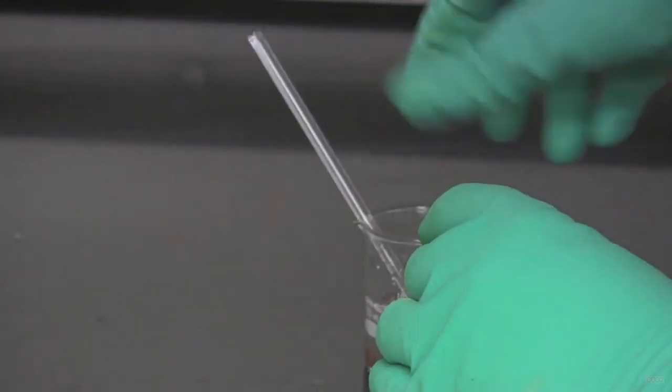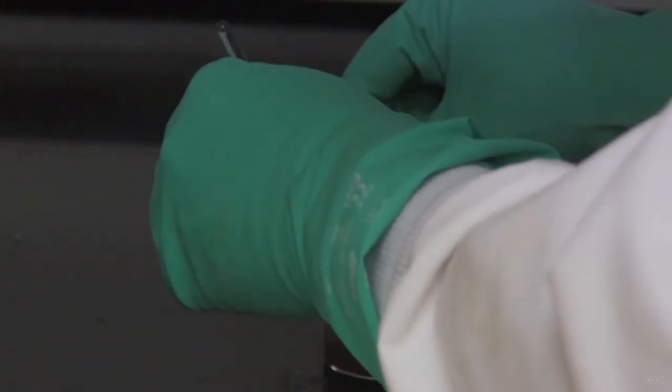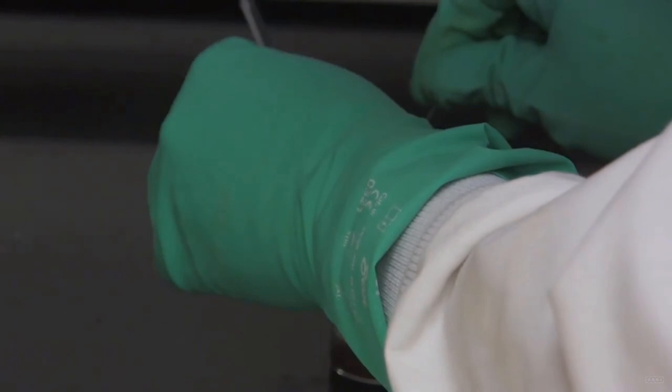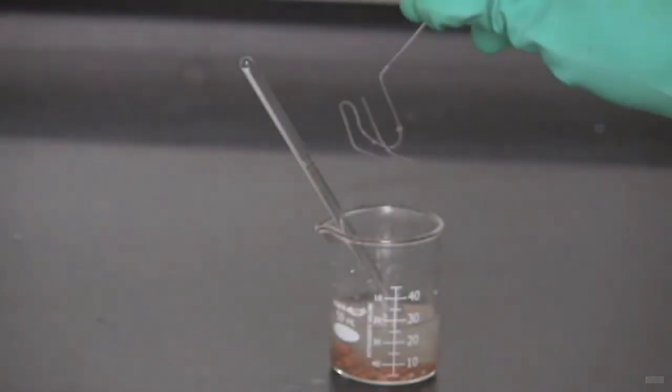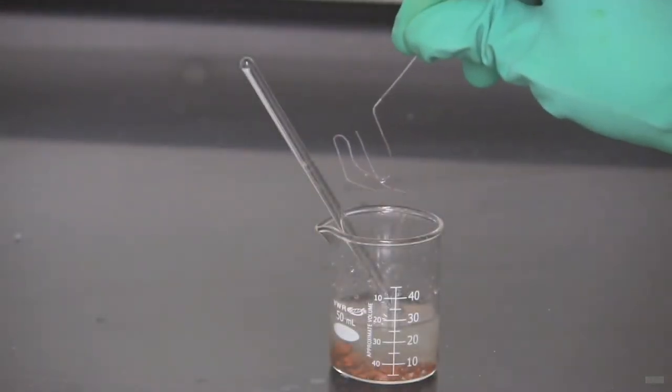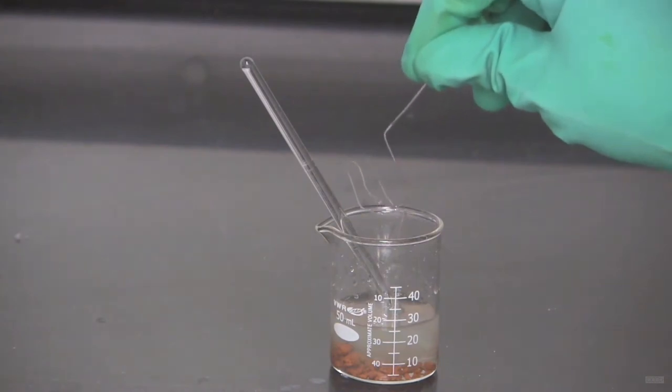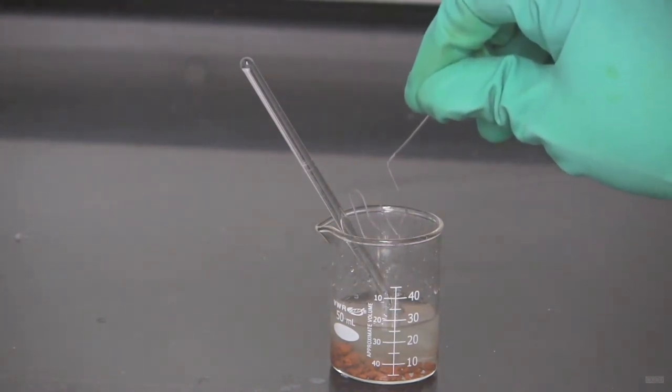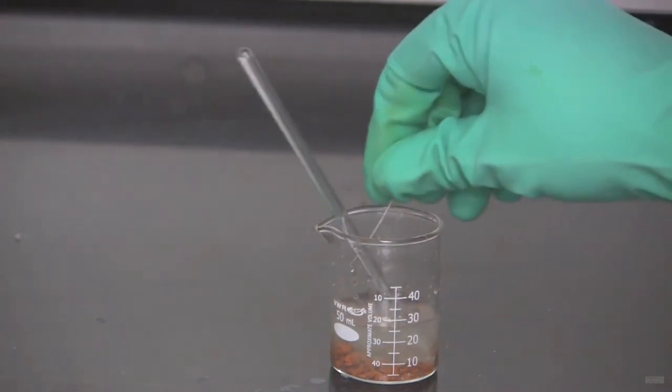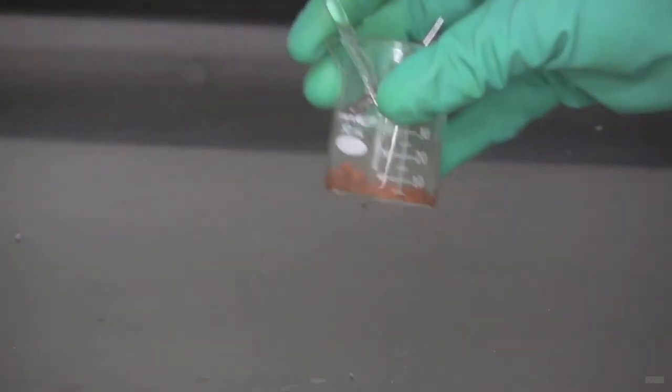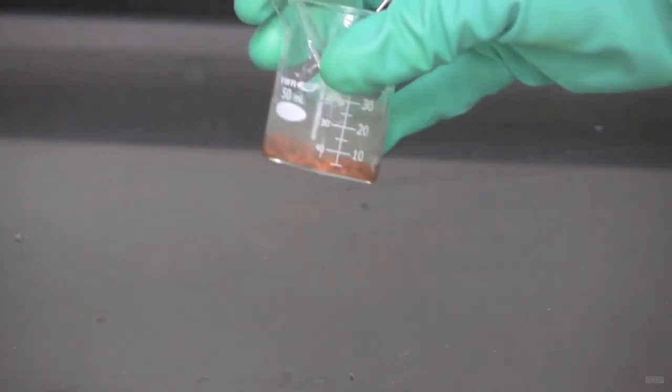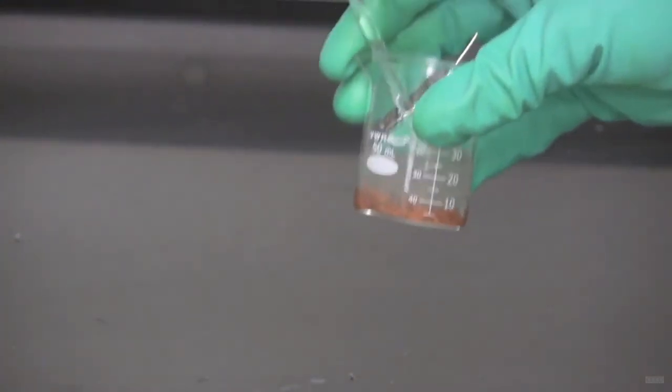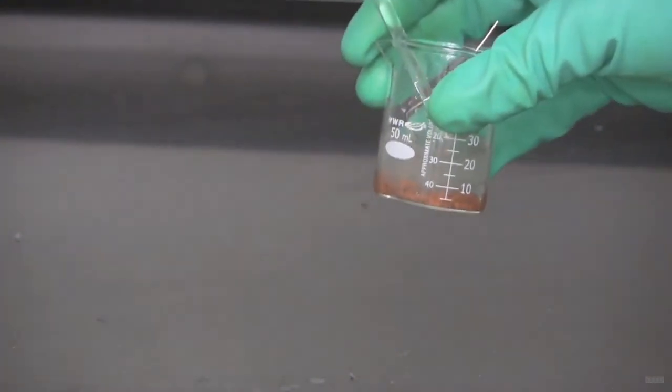So as you can see, with not too much effort, I've managed here to get the copper off the wire. Now if there's any copper that stays on the aluminum wire, you can always add a drop of HCl and that will end up removing it. But what we've got here is this situation. You can see all the copper sitting in the bottom of the beaker there. And now we can move on to the next step of filtering it.